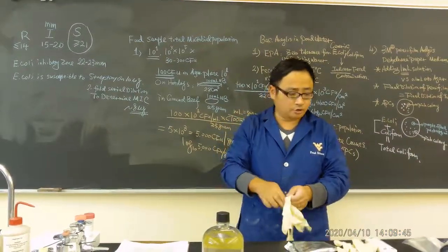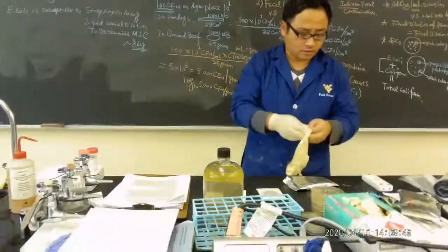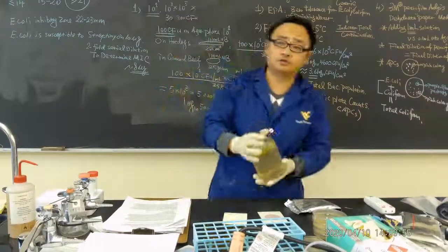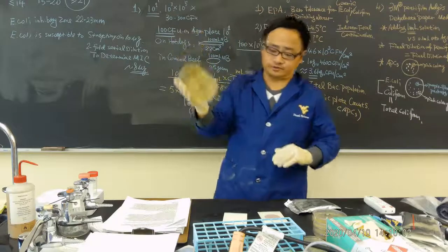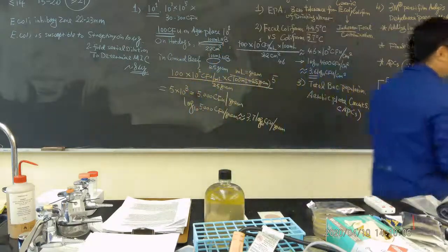So I'm going to just show you one example. We did get this pound of water. Anytime you do this water, the first thing you should do is shake. Make sure it's mixed very well, because a lot settles at the bottom. Okay? Now, of course, we're going to do a dilution.